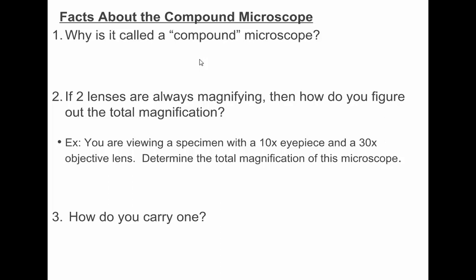All right, so yesterday you guys got to use the dissecting microscopes. Today we're going to be using these compound microscopes. They're going to work a little differently. They have some different parts that you need to be able to use. It's called a compound microscope because, like a compound word, two words put together to make one word like doghouse, this is called a compound microscope because it has two lenses that will magnify the image as we're looking at. The two lenses here are the eyepiece lens and the objective lens. Each one has a lens that enlarges the image that we're seeing.